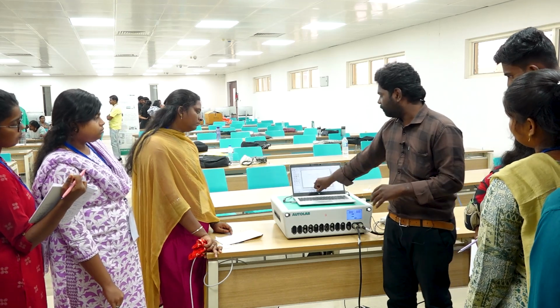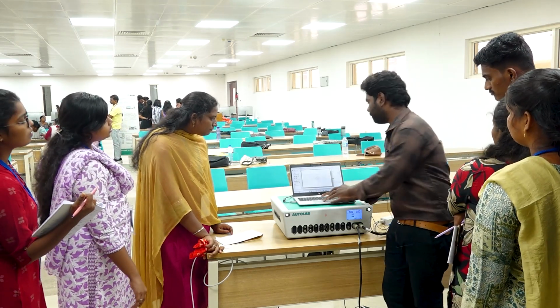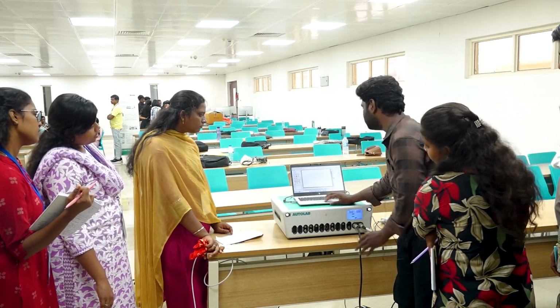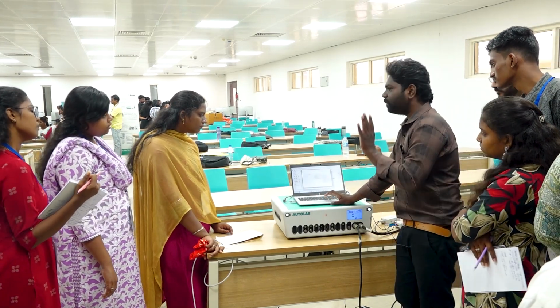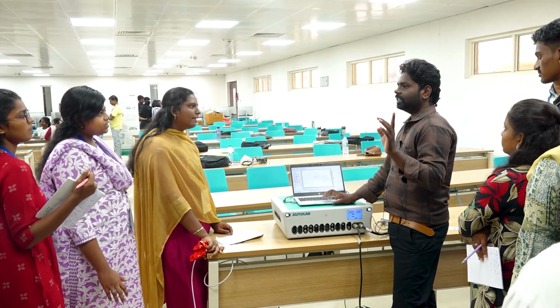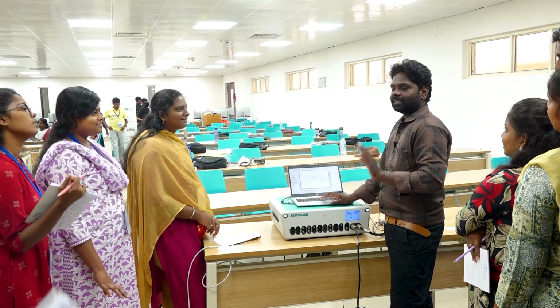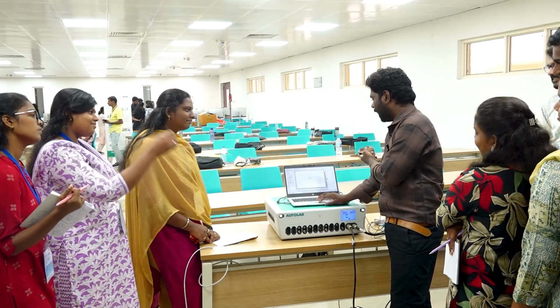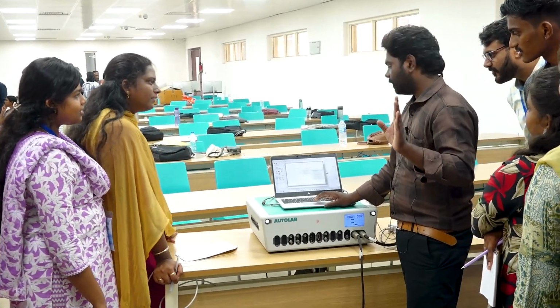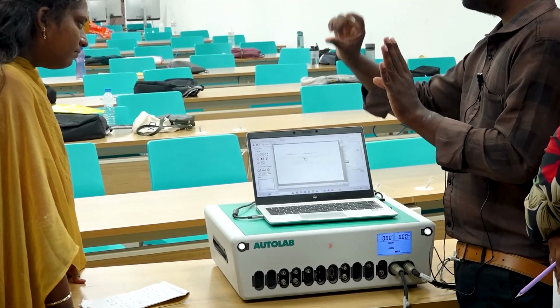So here, first we have just inserted the, let me delete this. So here, what is my first resistance in my graph? Series resistance or internal resistance? So add element. First graph, first element is internal resistance, right? So there is no separate resistance.